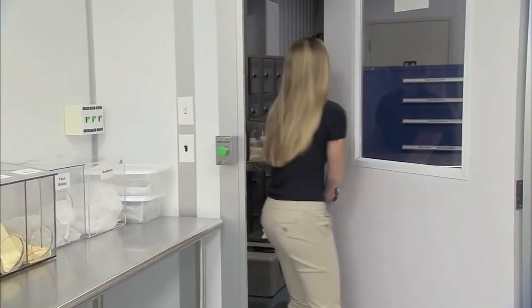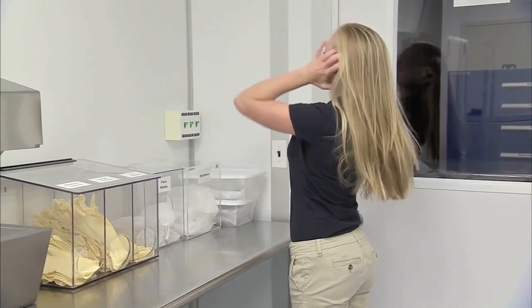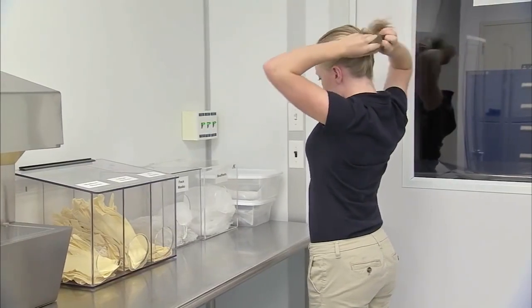After entering the gowning room, cleanroom users should always gown up in a top-down manner, starting at the head. First, place the bouffant cap over your hair and ears.